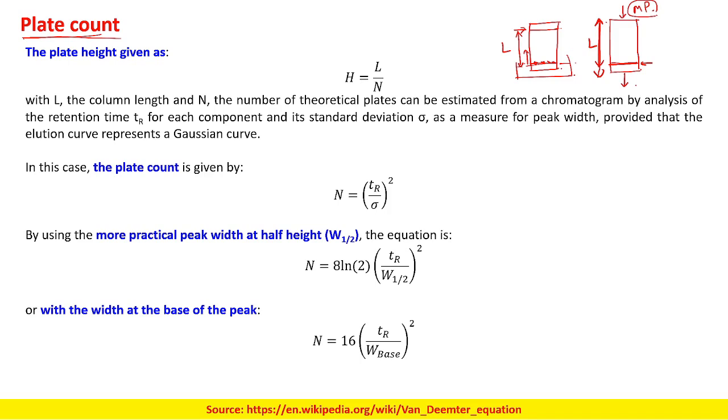You get some analytes, you detect them, and then you get a graph. In our last class, I discussed that if you are analyzing in the inline process, you will get a peak like this, and this is the concentration of the analyte. In paper chromatography, you will have a dot, and across the central part there will be a band, so you will not get specific pointed dots.